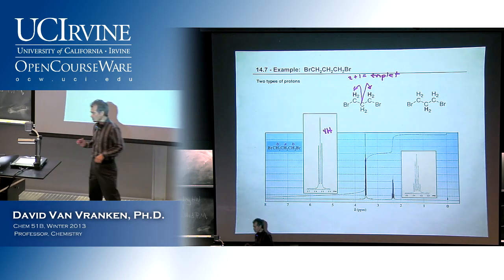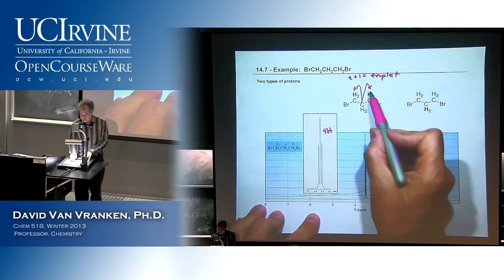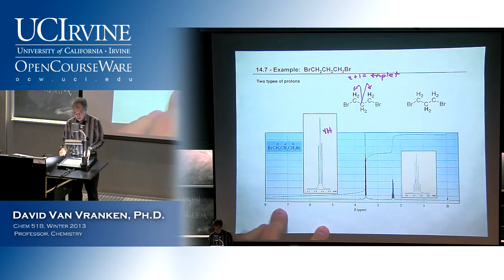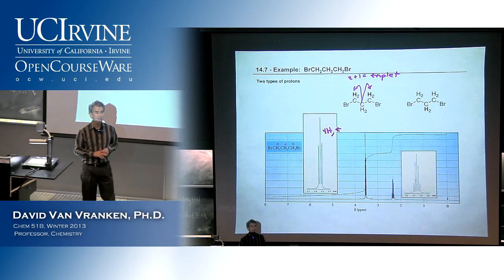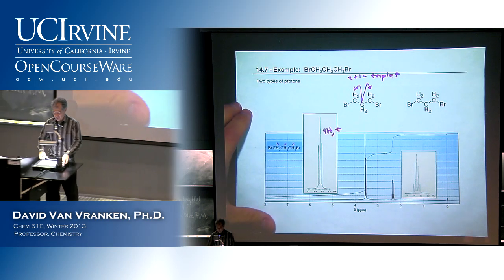It's amazing. Even though these four protons aren't all attached to the same carbon, they still are affected by this neighbor in the same way, following the N plus 1 rule. So I would call that a 4-H triplet. That's the way you would abbreviate that in an NMR spectrum: 4-H, comma, italics T. We use italics for singlet, doublet, triplet.